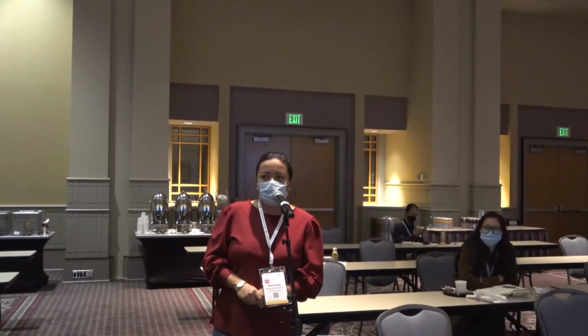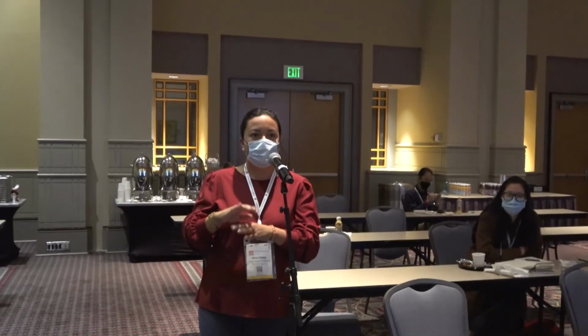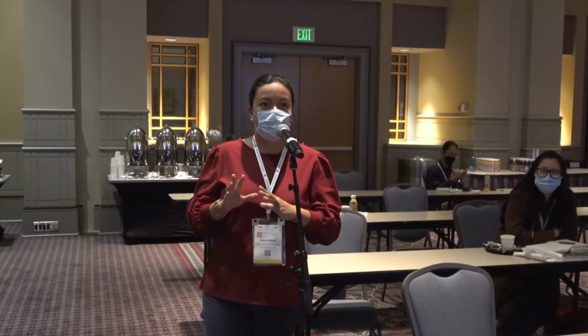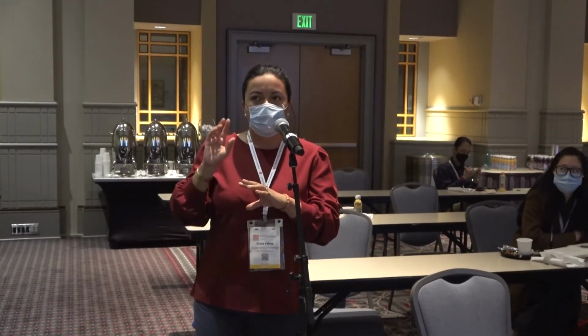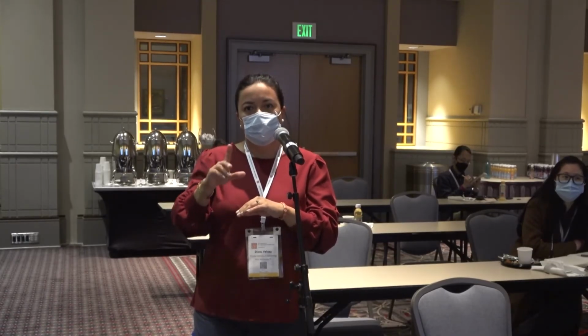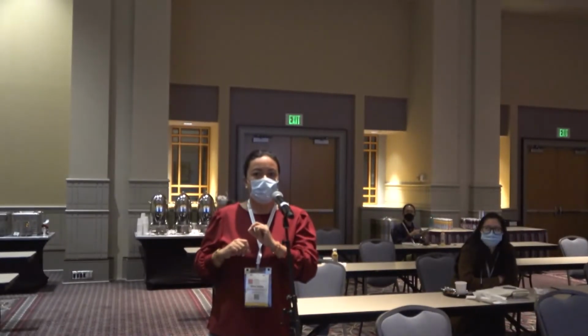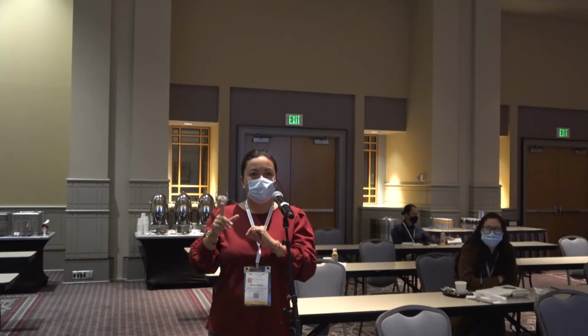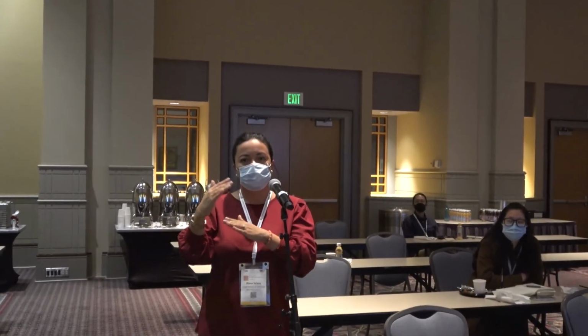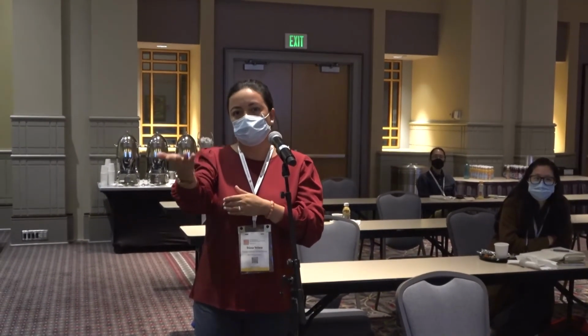Very interesting talks. I had a question about the software. I'm not familiar with high-throughput proteomics, so that was very enlightening. But can you utilize this to filter through ion mobility as well? I know you mentioned that at one point, but I wasn't clear on that. I was asking specifically about ion mobility. Are you able to use this software to filter not just by phosphorylation or mass to charge, but additionally by ion mobility? Oh, yes. By collisional cross-section?